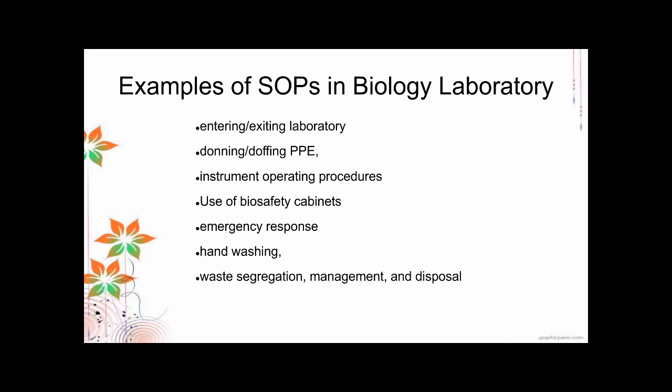And then how do you deal with the waste? Of course, these are hazardous wastes. You don't just put all of them in a plastic bag and then put it in the waste basket. There must be proper segregation, management, and disposal of the waste. And of course, inventory control. This is for biosecurity so that you avoid theft of dangerous materials and infectious agents in the laboratory.